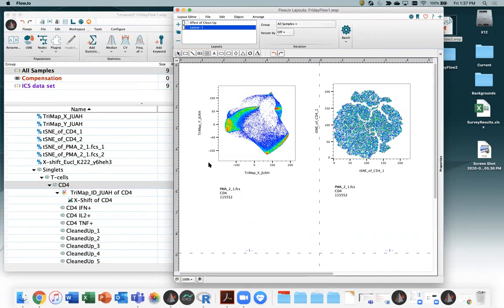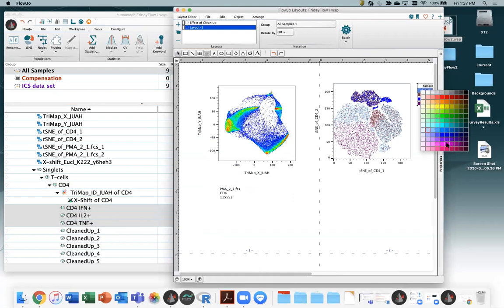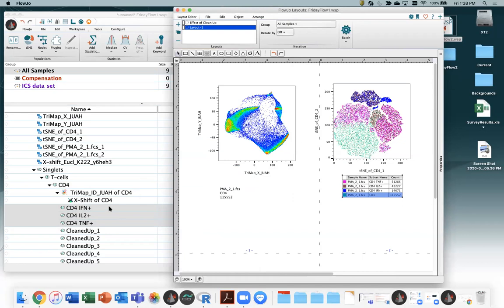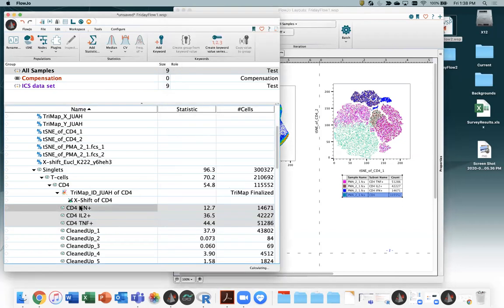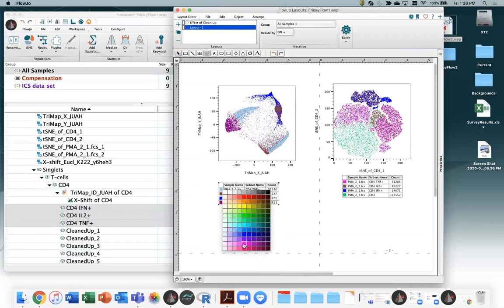Okay, so yeah, a fairly nicer, more spread picture if you want of the t-SNE, perhaps some better separation. And then if we want to take some of these CD4 populations that I just hand gated and overlay them, you see again the plot that I showed before, without quite as nice a color scheme in use. When I now choose two very similar colors, let's make one of those green. Okay, and drag those onto this plot, and make sure colors are relatively the same. Cool.